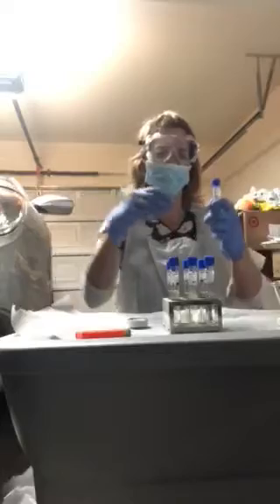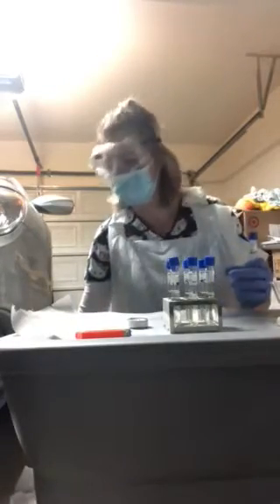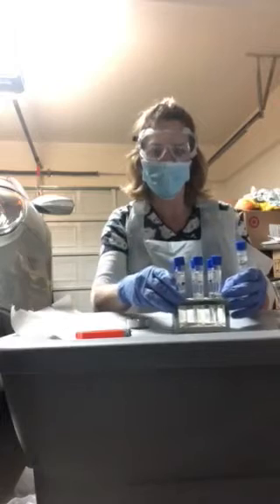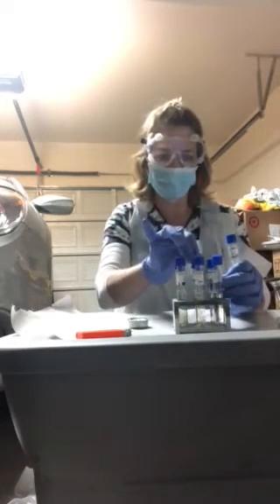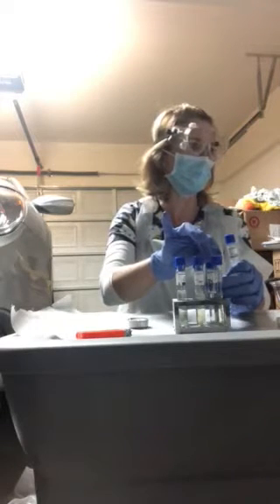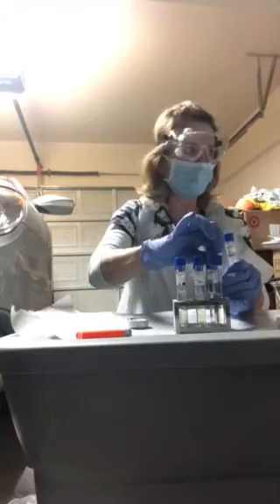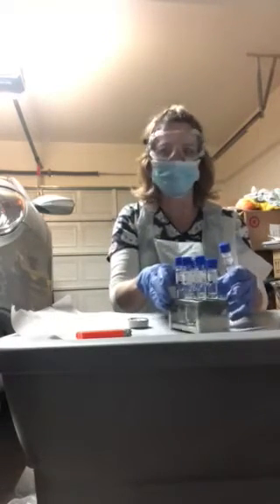Hi, this is Patricia Prickett, Bio 225. This is week six of class, and I am doing my lab — the first part of my lab, environmental influences of microbial growth and salt tolerance testing.